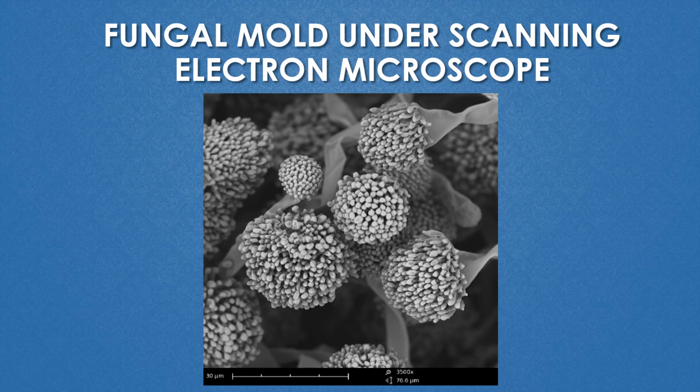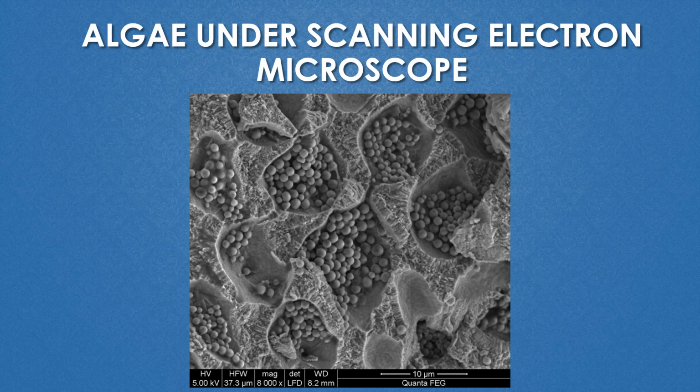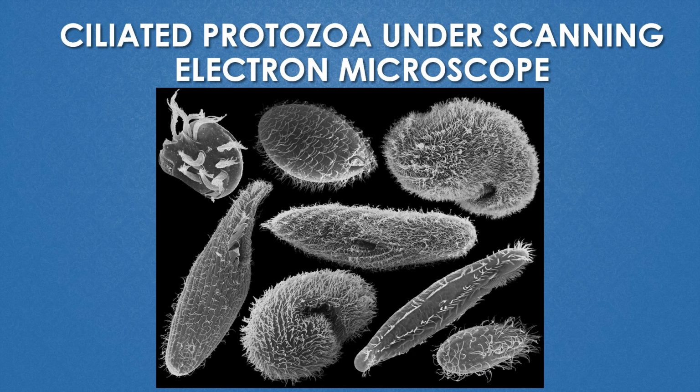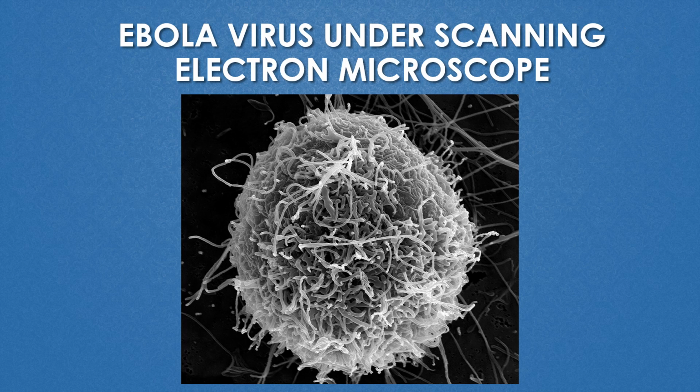This shows algae. This shows an amoeba. This shows ciliated protozoa. And this shows the Ebola virus under the scanning electron microscope.